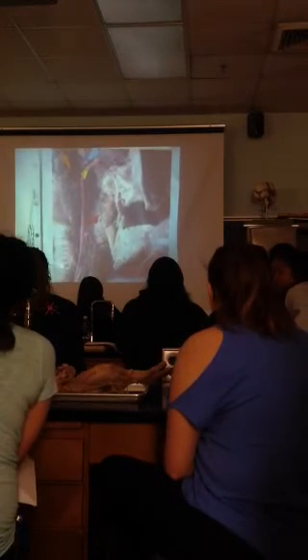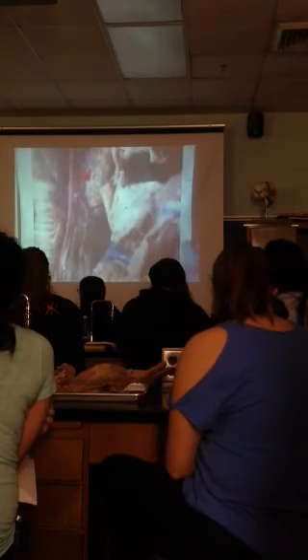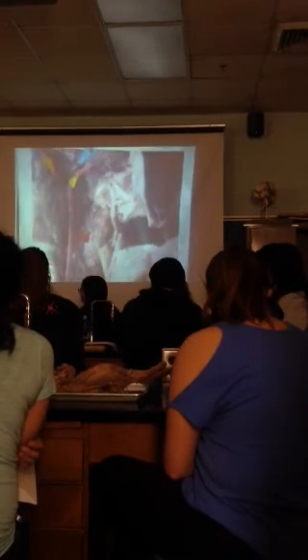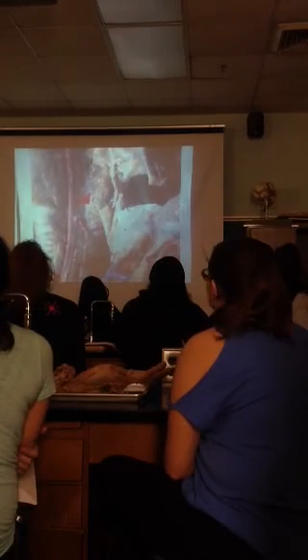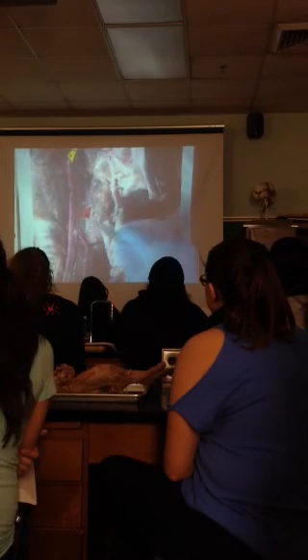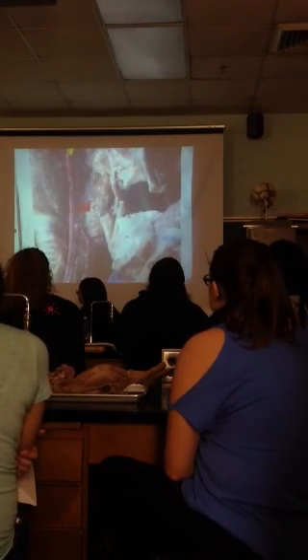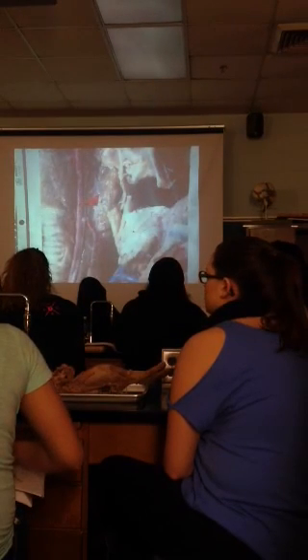And this huge long pipe in red is an artery. Anybody have a guess what it is? Common carotid, yep. And this is actually the cat's left side, so this is left common carotid. We probably won't ask you that, we'll just say, is that a common carotid? Okay, so here's a couple that you can say.